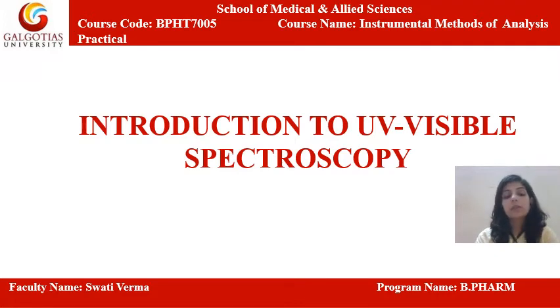In our previous lectures we discussed the basics of spectroscopic techniques, that is, what spectroscopy is, the different types of spectroscopic techniques and their various functions. Now we'll discuss each and every spectroscopic technique in detail. First we will discuss UV visible spectroscopy.